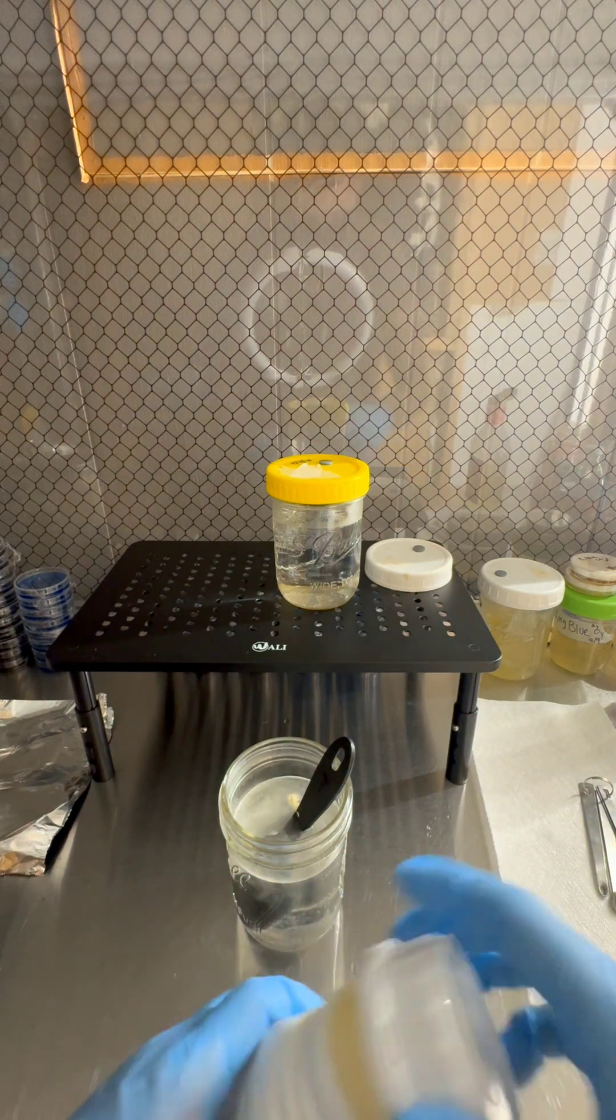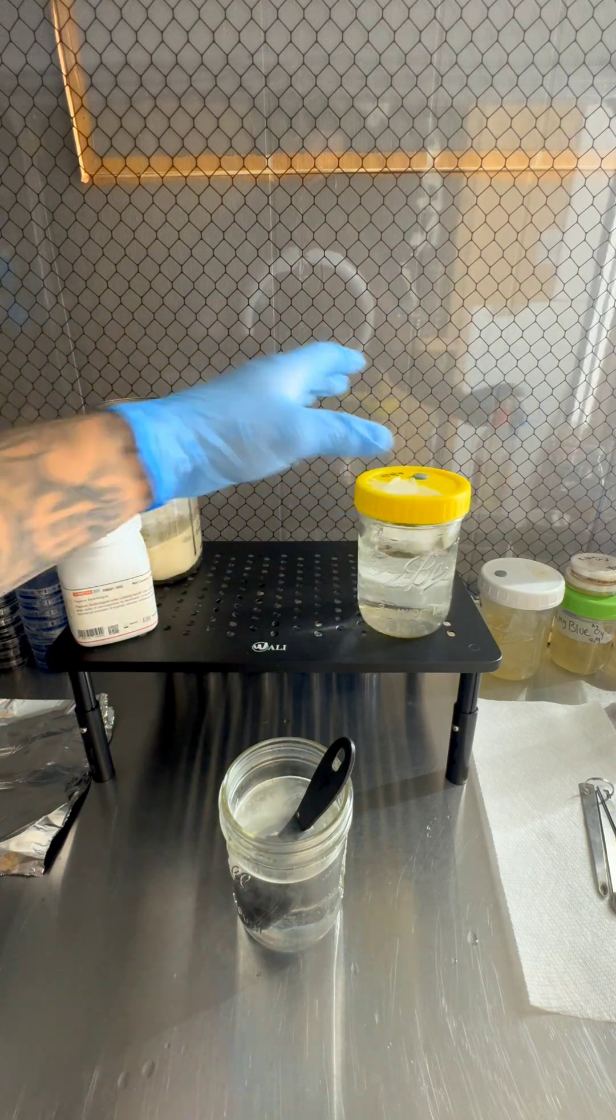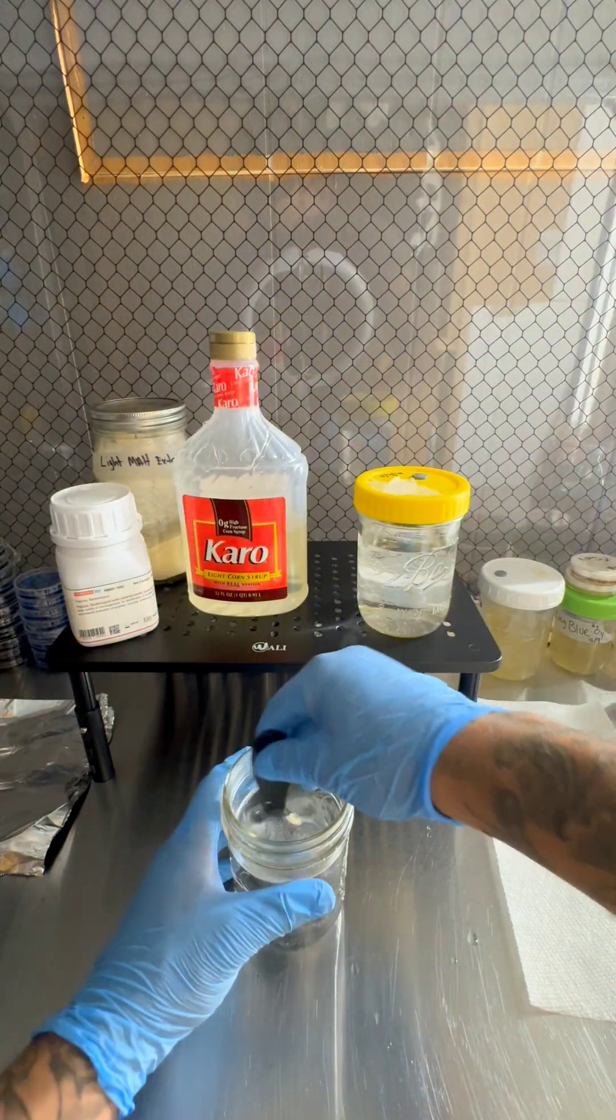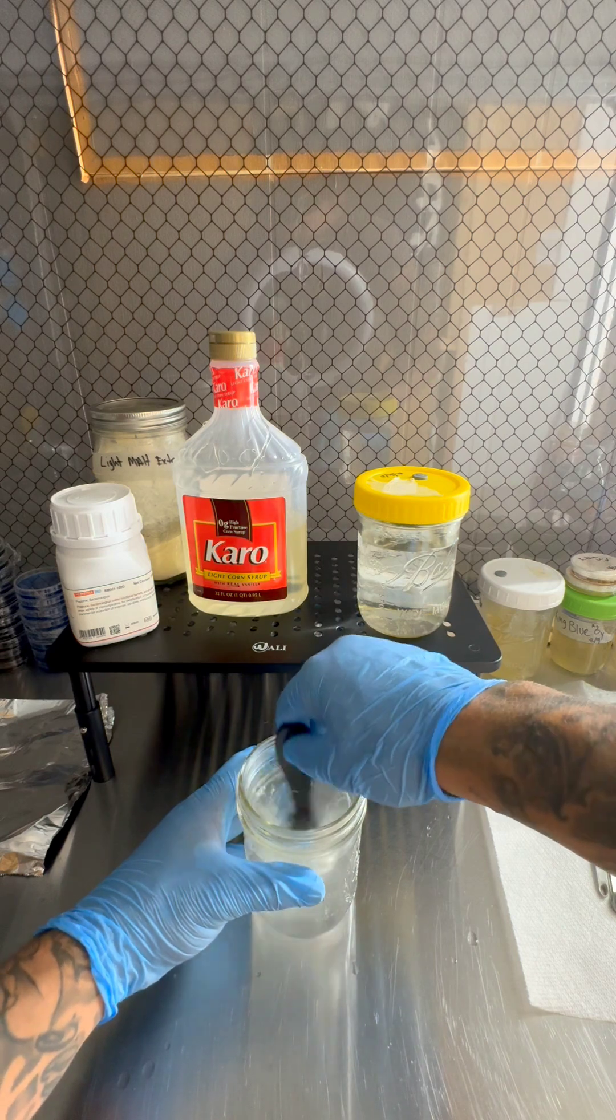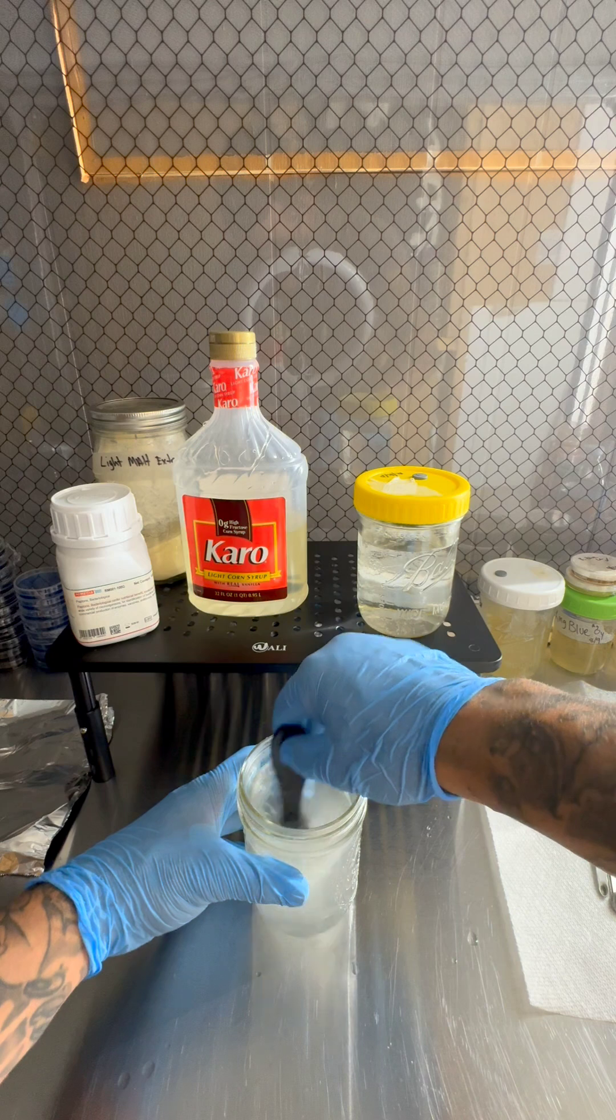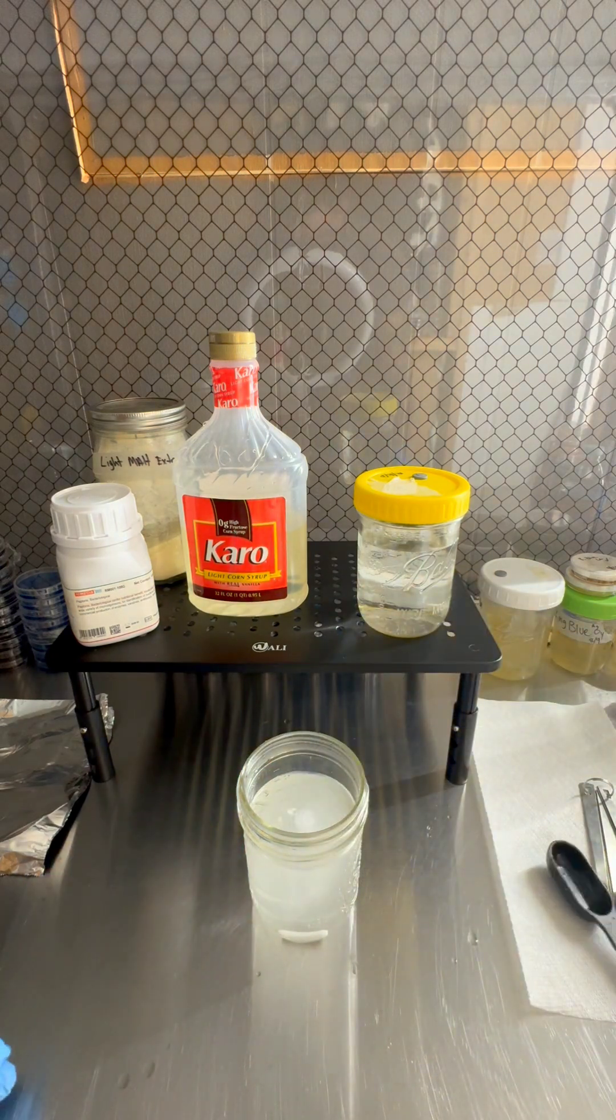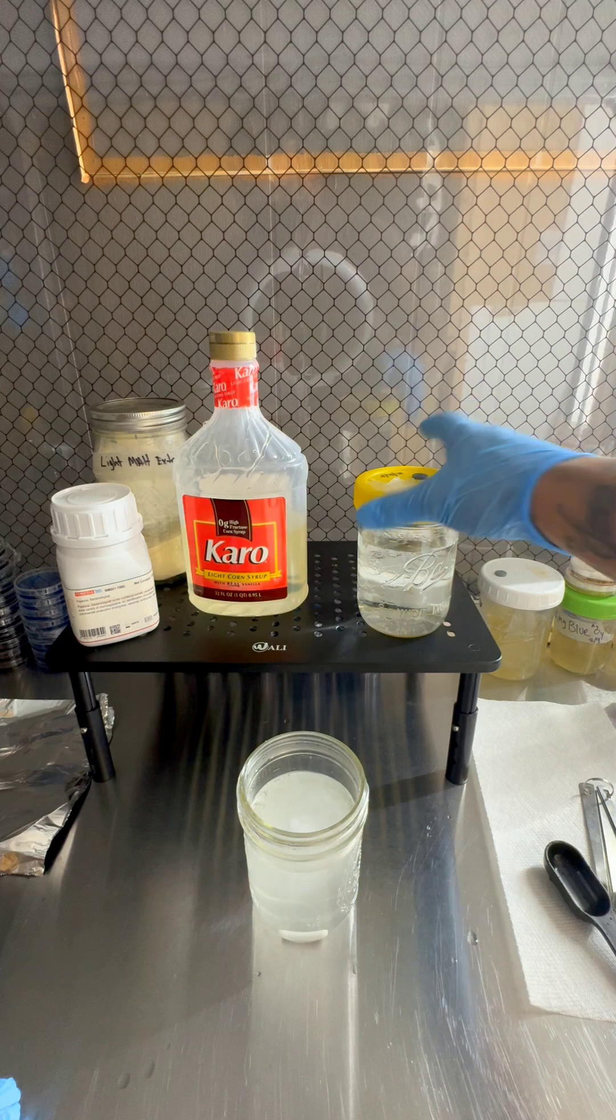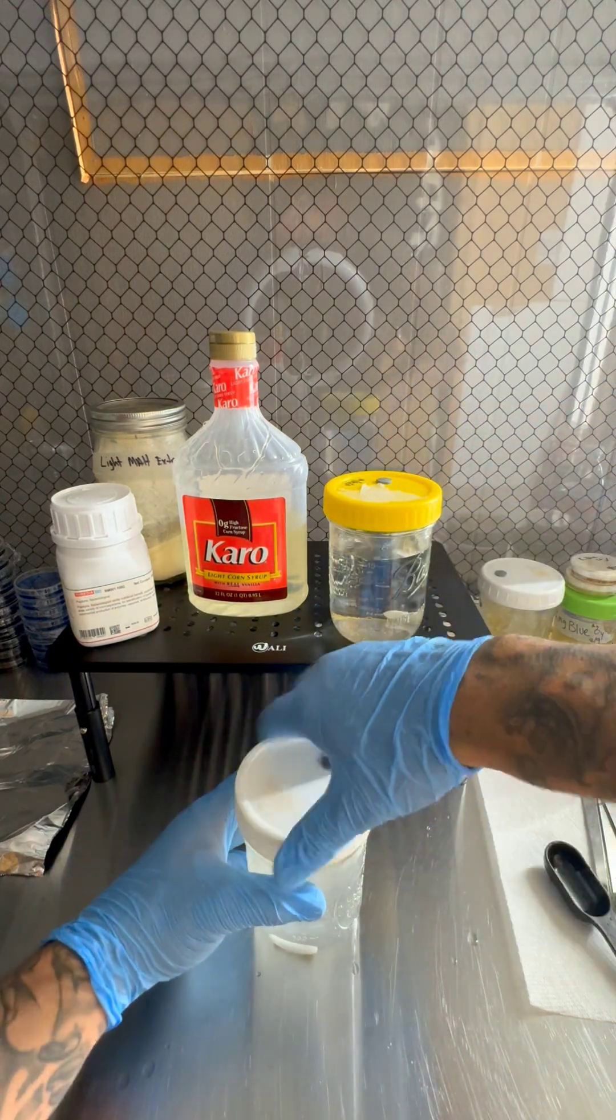Lid on everything. Go ahead and give it a mix. So this is my recipe y'all. This is 300 milliliters of water, a pinch of light malt extract, and a pinch of peptone. I'm going to go ahead and cap it.